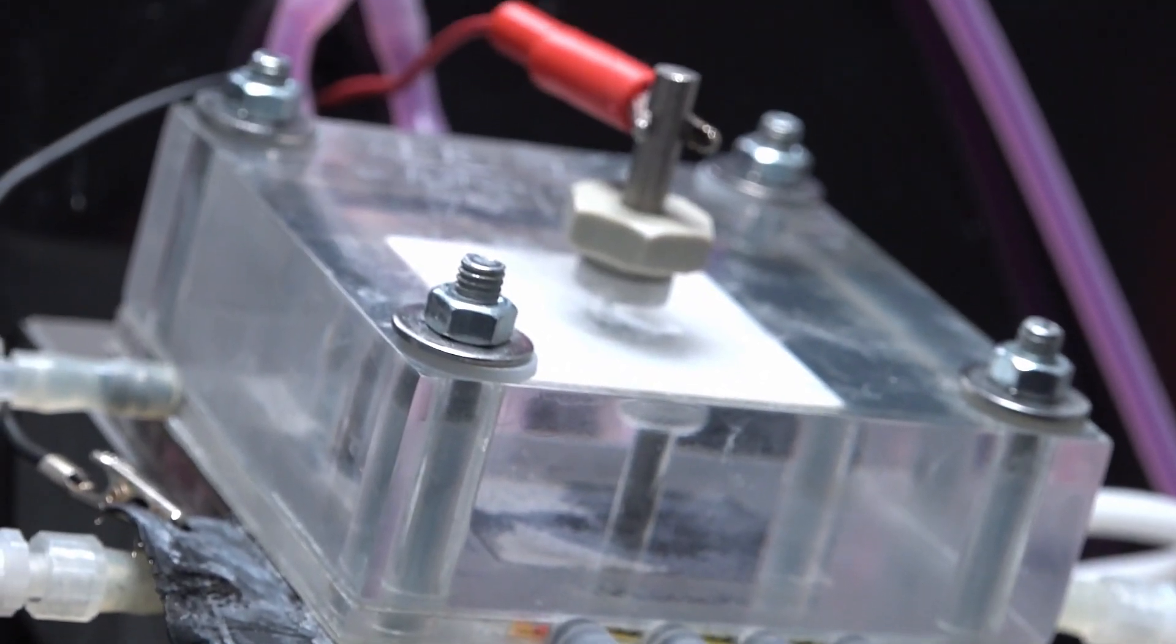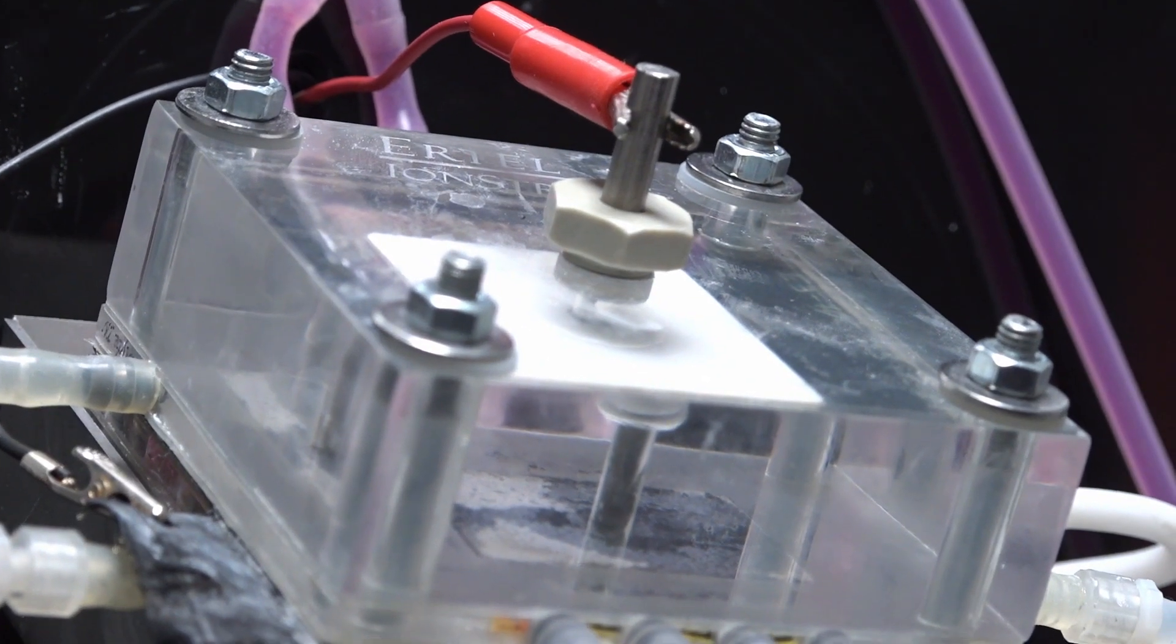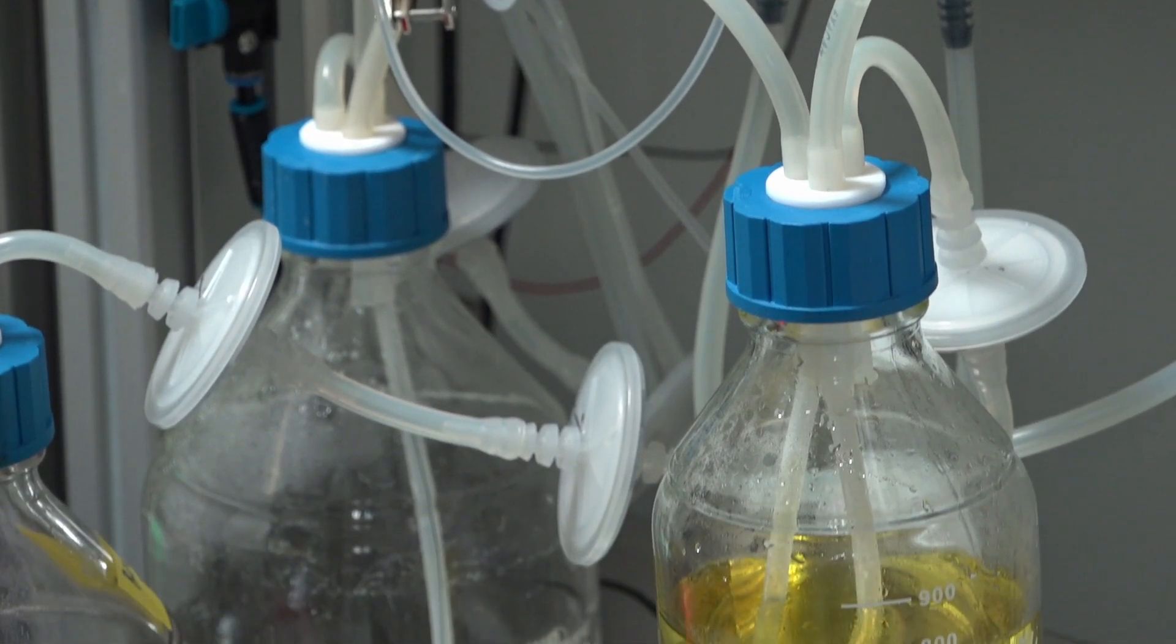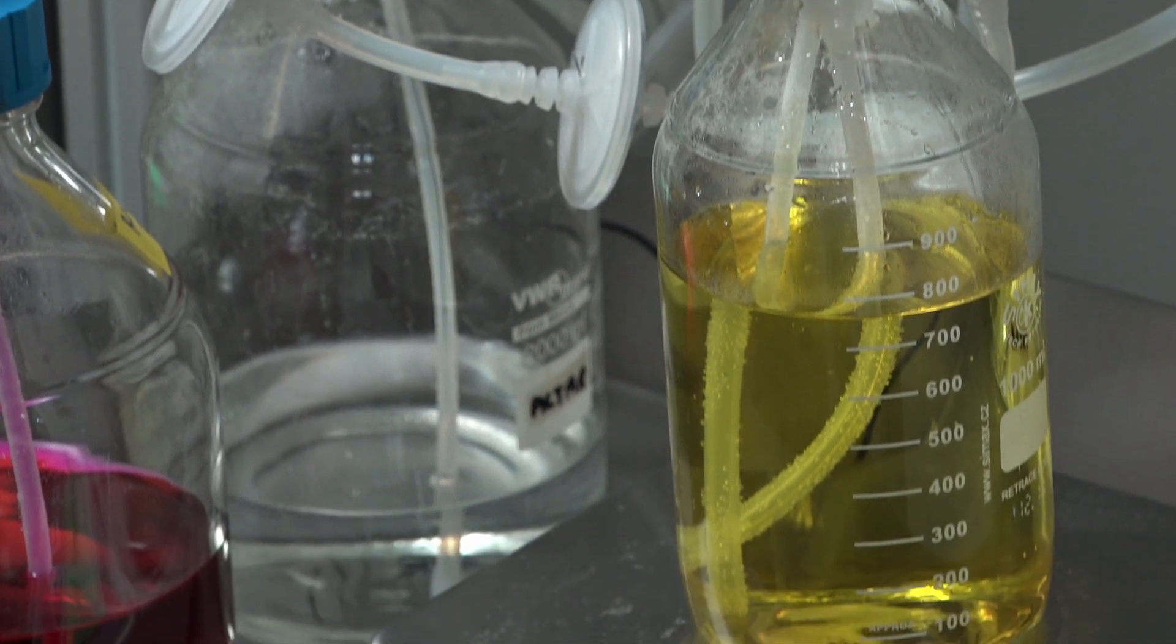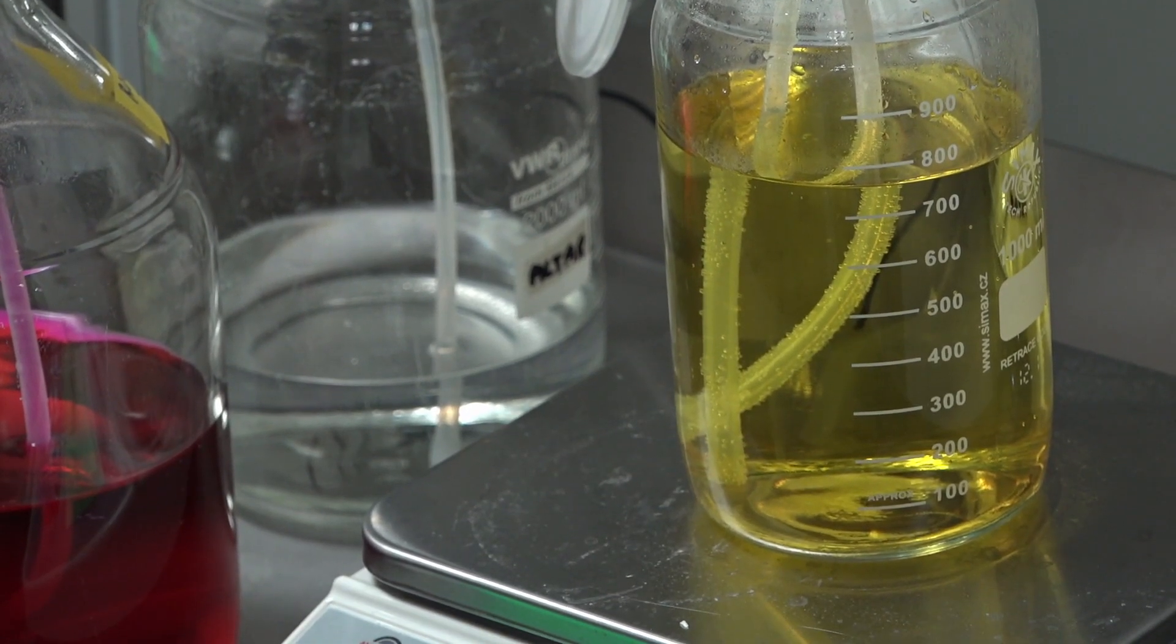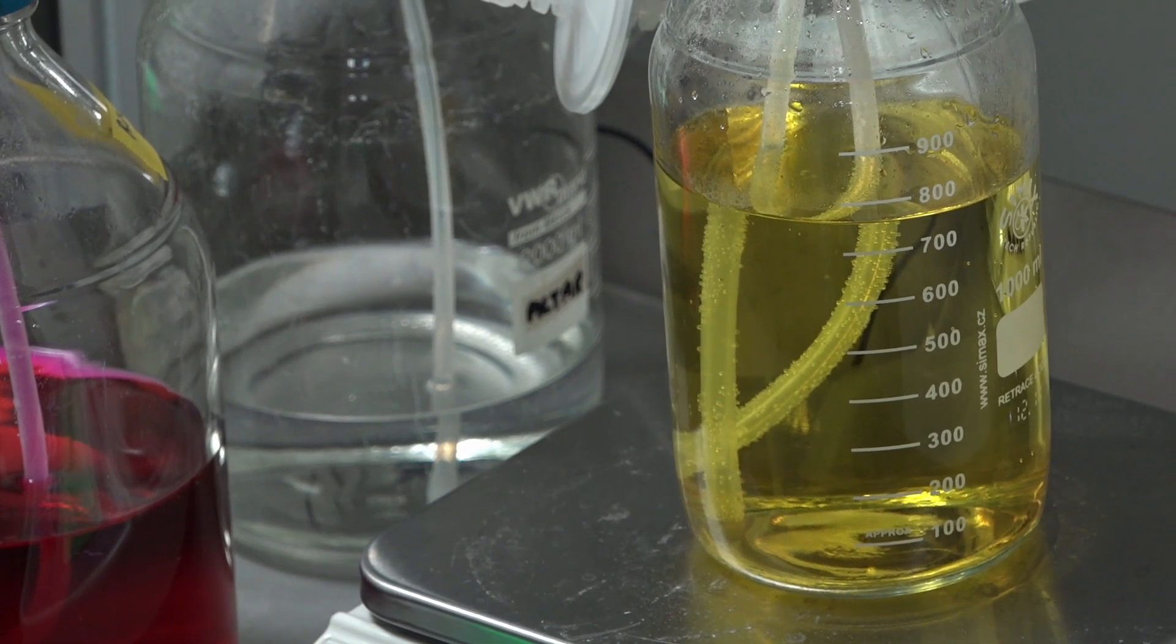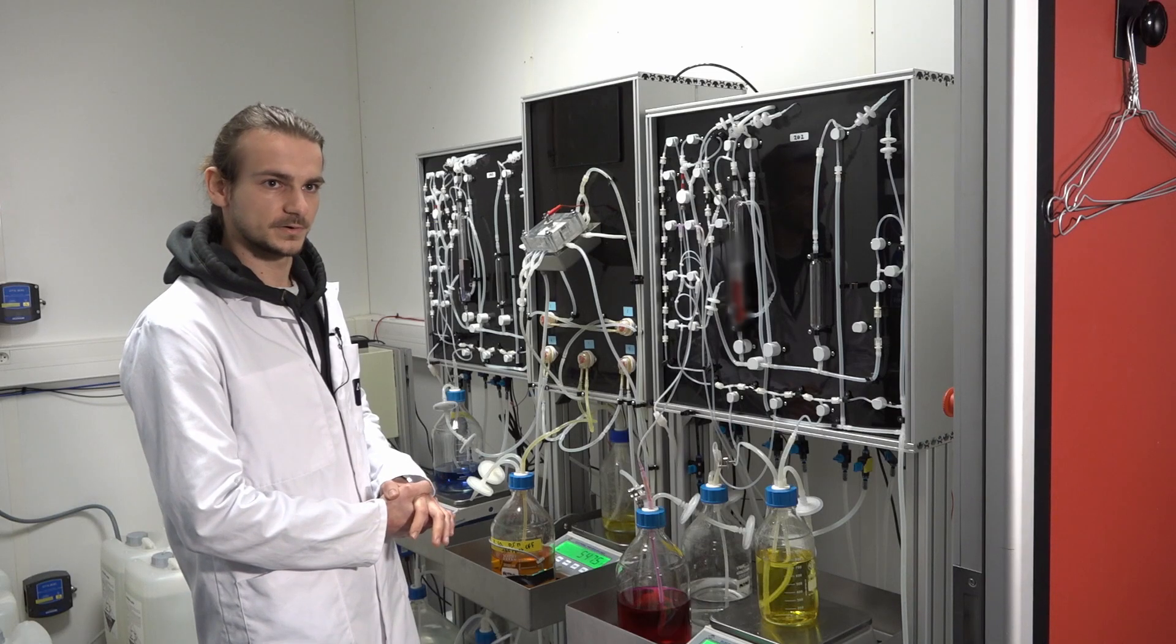Thanks to that, we can produce the formic acid using electricity and CO2. The formic acid is transferred into the bioreactor in which it will be able to be eaten by the bacteria in order to produce biofuel.